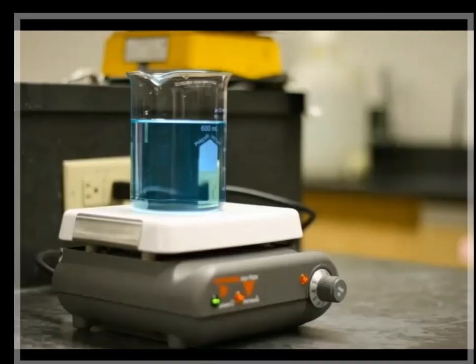Often you will be required to heat your materials using a hot plate. Be cautious when handling the hot plate and any heated glassware. It is not obvious that the heating surface or glassware is hot. Avoid burns by allowing glassware and the burner to cool completely before handling. Always make sure the electric cord does not come into contact with the heating surface and the hot plate is turned off and unplugged when you leave.